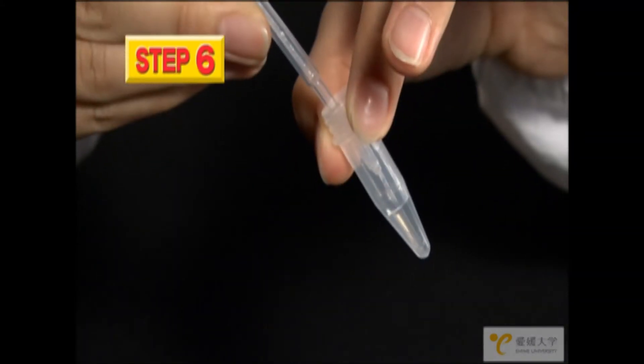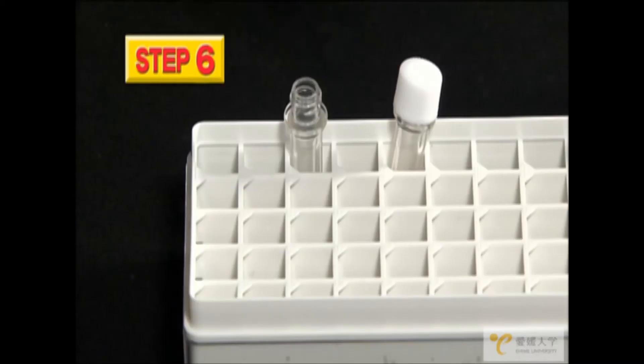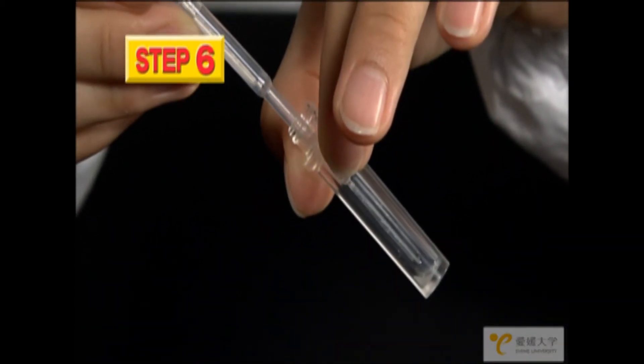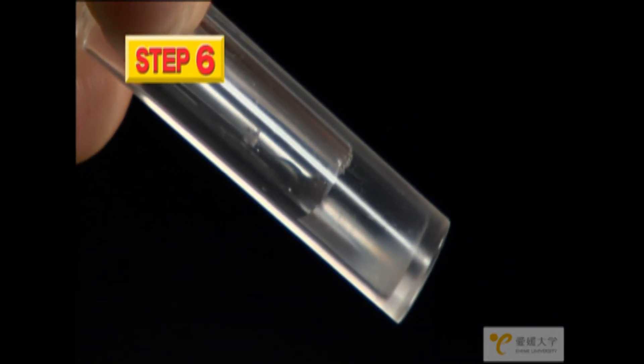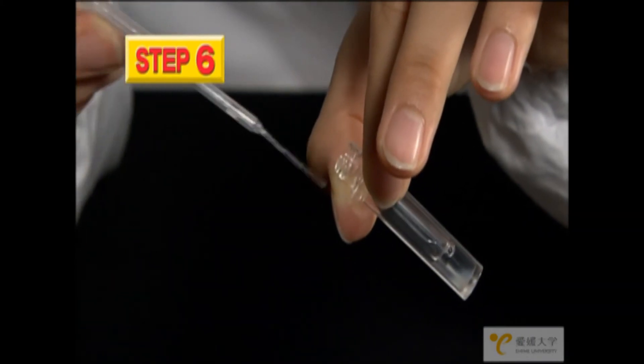Use the dropper to collect the liquid in the remaining tube with the blue cap and, as before, very carefully expel the liquid into the large tube so that the two liquids do not mix, creating two layers. The bottom layer will be white.